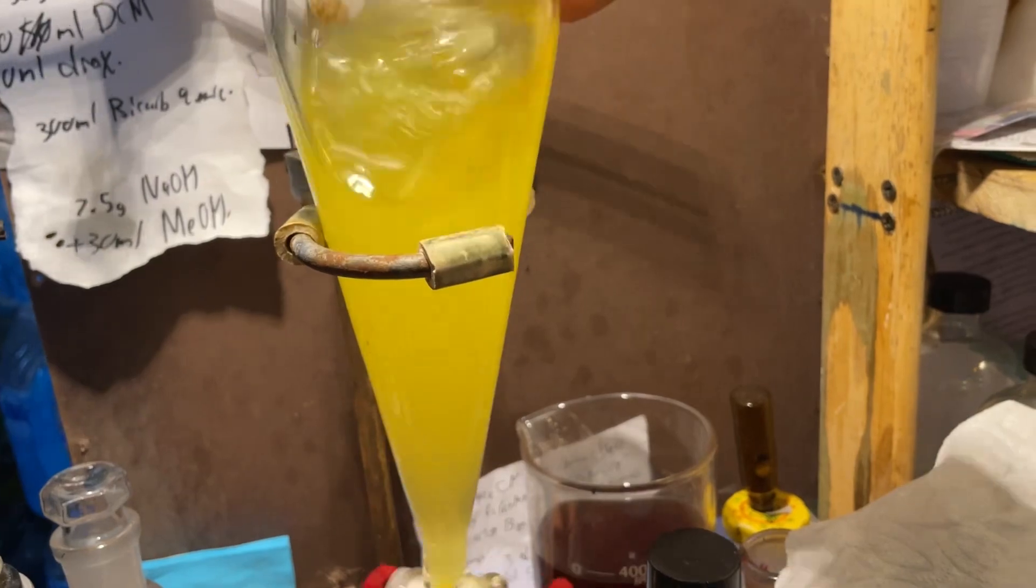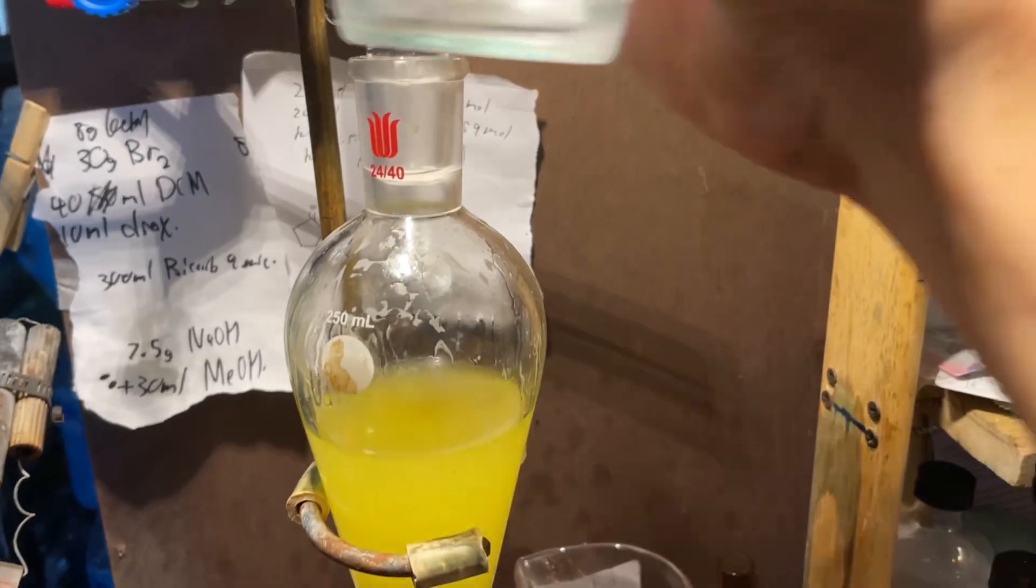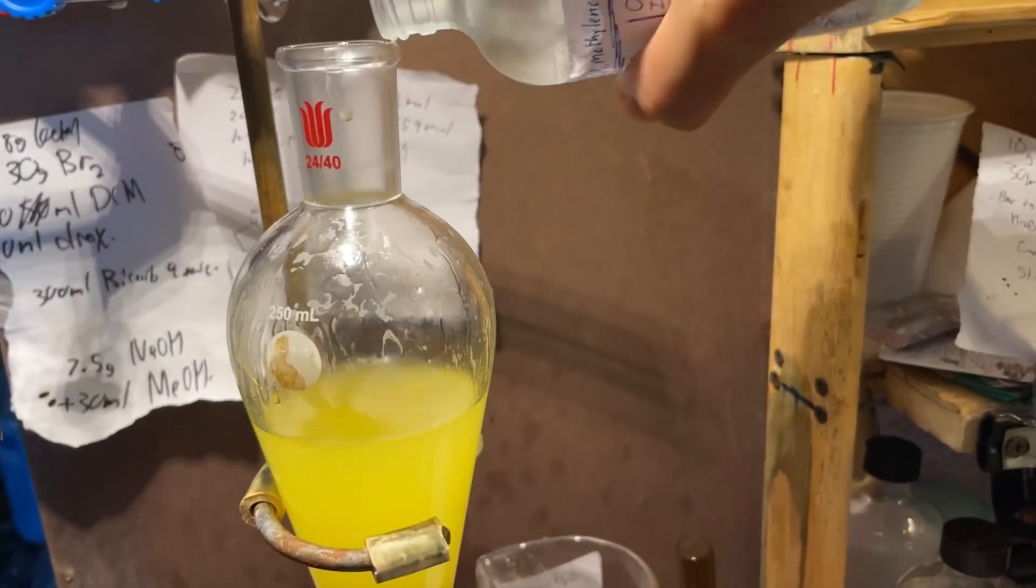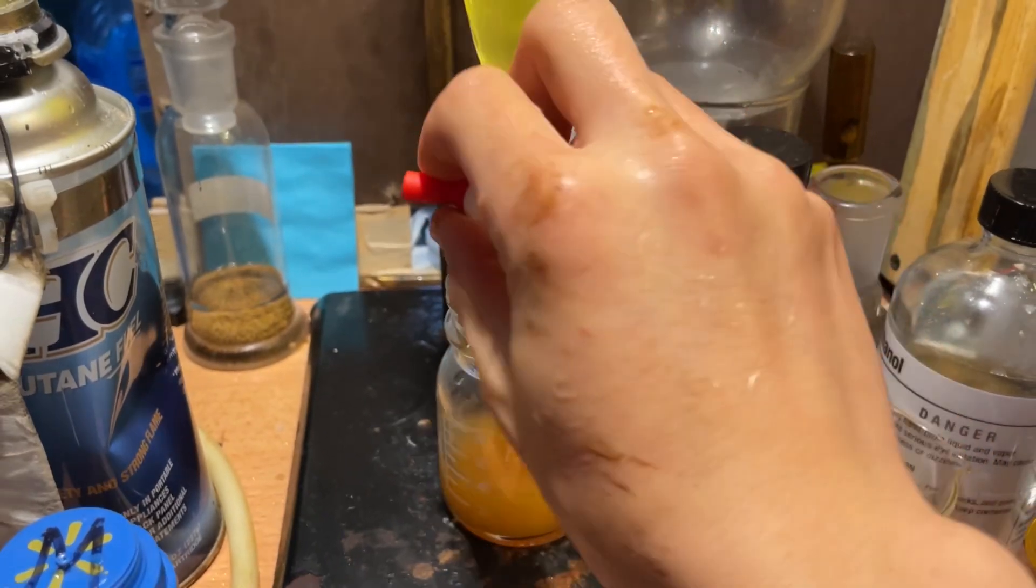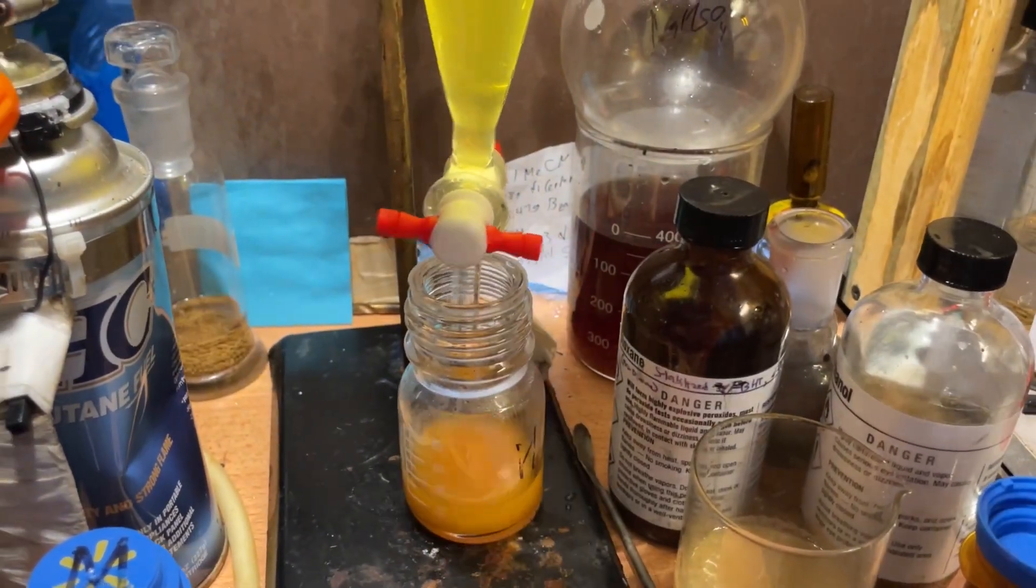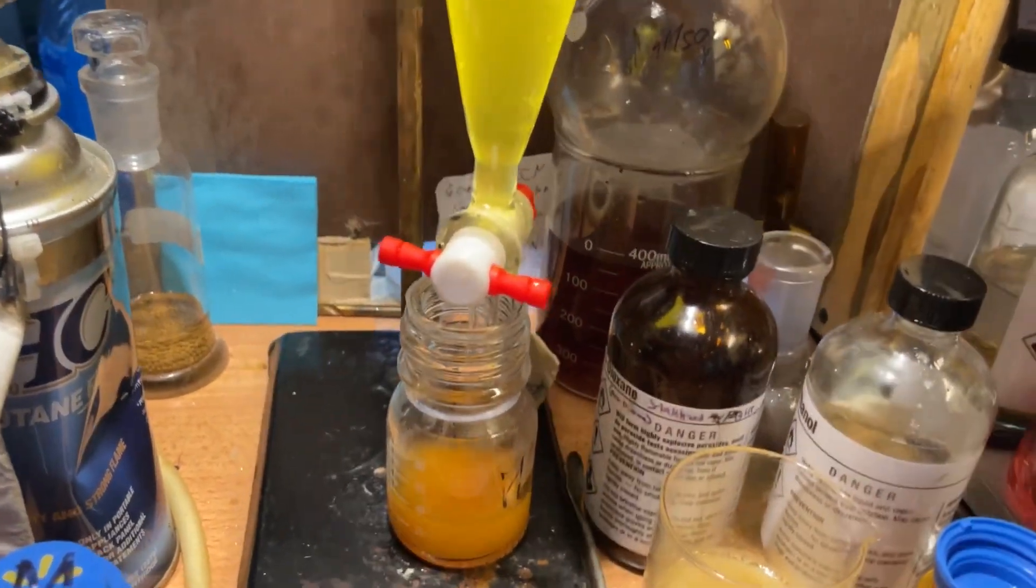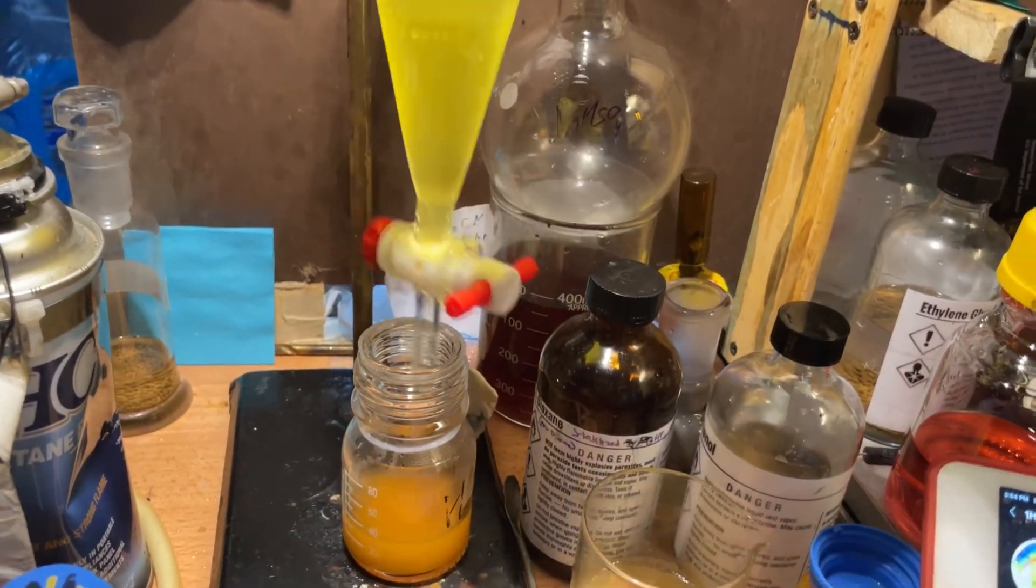Now, we're going to set that aside for now, and we're going to extract the aqueous with some dichloromethane. Now, I did not let the aqueous layer cool down, so yeah. And, again, a big dumb. So, oh, well, we're going to lose some yield, but that's fine for me, because I'm not after yield. I just want some benzaldehyde around.